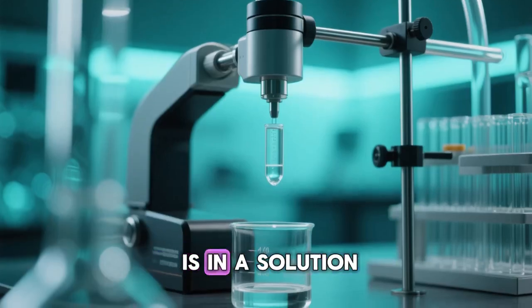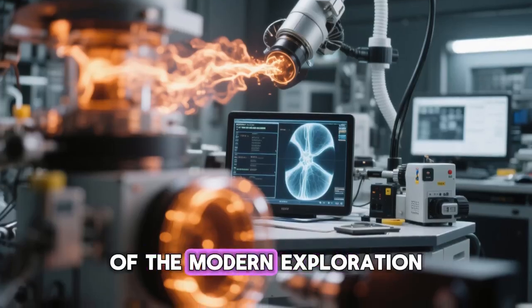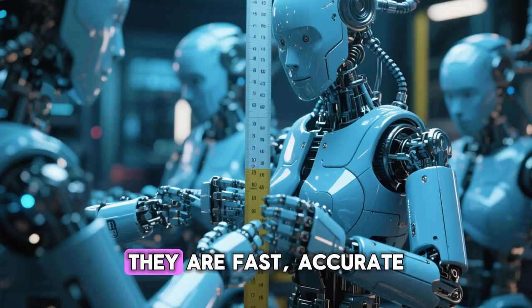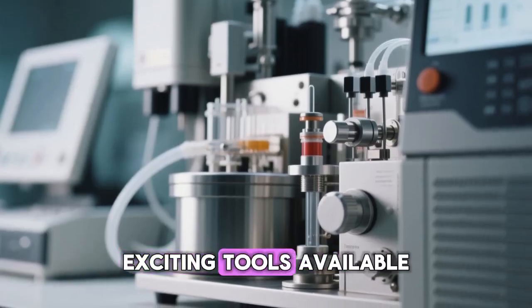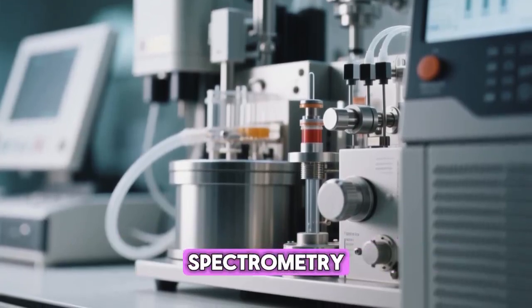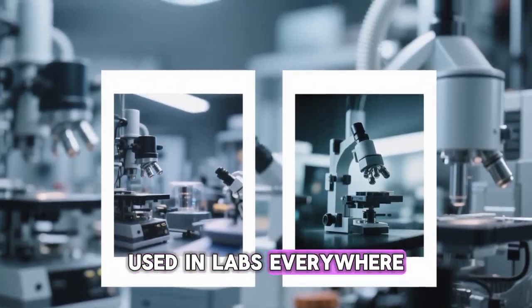Now that our sample is in a solution, it's time for the main event: instrumental analysis. The workhorses of the modern exploration lab are plasma and X-ray based techniques. They are fast, accurate, and can measure many elements at once. Let's start with one of the most exciting tools available: inductively coupled plasma mass spectrometry, or ICP-MS. This is a game changer and is now widely used in labs everywhere.